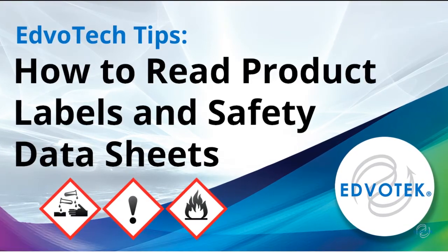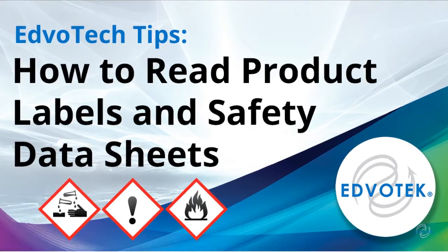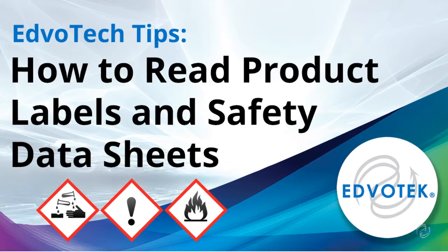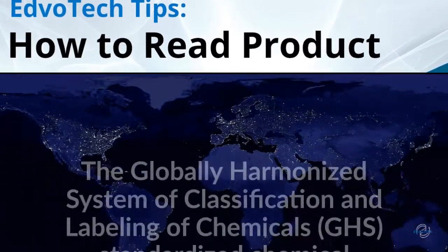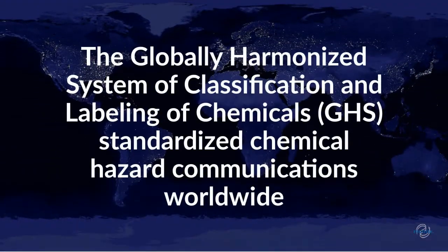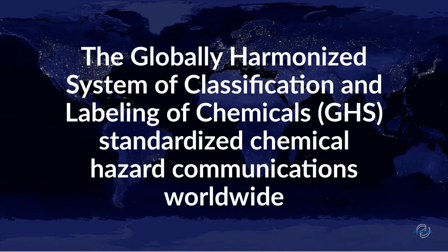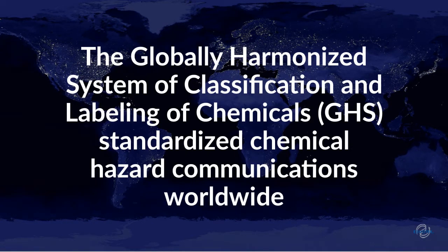Edvotech Tips: How to Read Product Labels and Safety Data Sheets. In March 2012, the United States Occupational Safety and Health Administration, or OSHA, adopted the Globally Harmonized System of Classification and Labeling of Chemicals, or GHS.